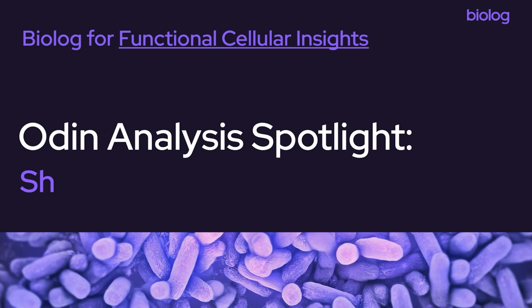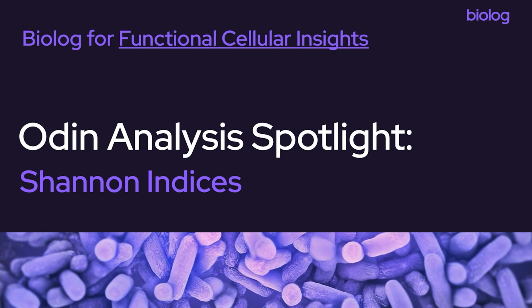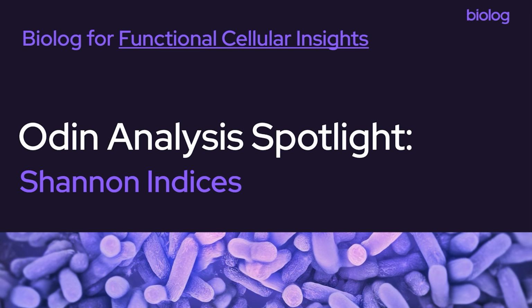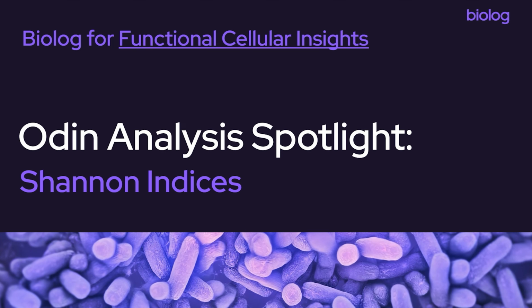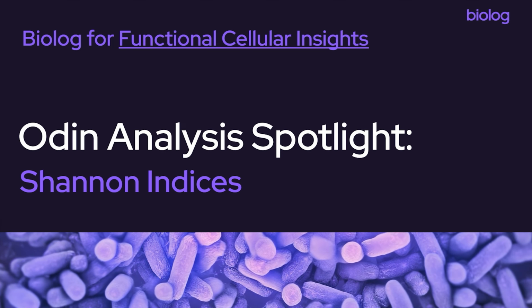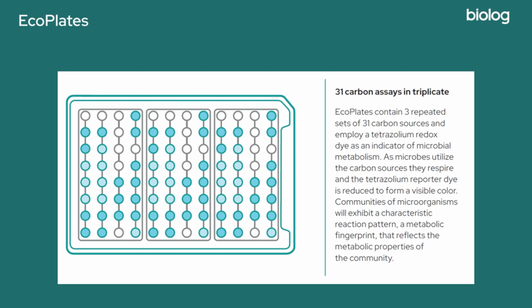Today, we are going to take a look at how you can leverage the Odin Community Analysis software package to learn more about microbial communities like those found in soil using Shannon's Diversity Index, Shannon's Evenness Index, Average Well Color Development, and EcoPlates. EcoPlates are a great drop-in solution for assessing the flexibility of a microbe or community of microbes with regard to what carbon sources can be utilized for energy production.